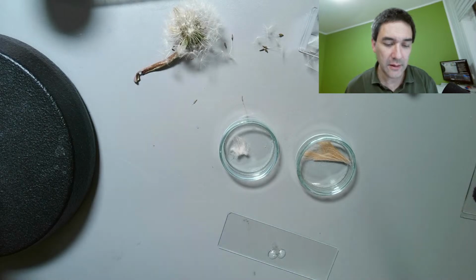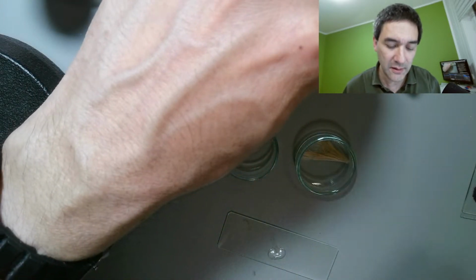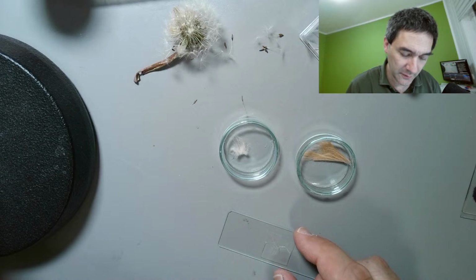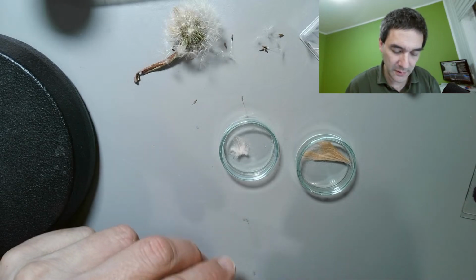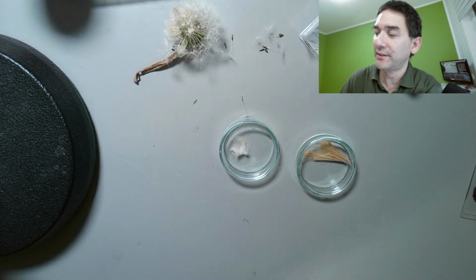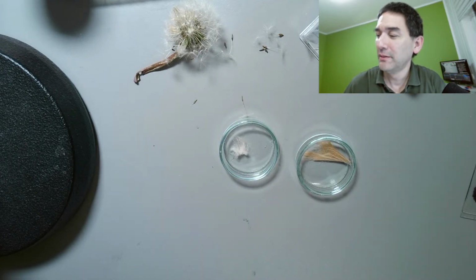Okay, and a cover glass, and let's see how this works. But this seems to be fairly highly processed wool. Maybe, and I need to have a look here.